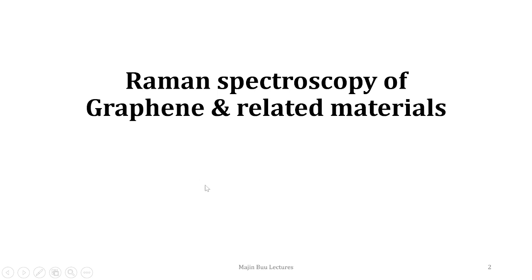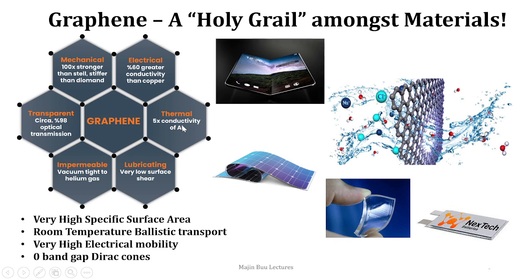In this presentation, we will be discussing the concept of Raman spectroscopy of graphene and its related materials. Graphene, as we all may know, has become very pervasive in quite a lot of applications ranging from flexible electronics to water purification, deionization, batteries, and many other applications, especially owing to its excellent mechanical, electrical, thermal, and other properties. Furthermore, this material is being widely used for engineering applications as mentioned, thus making it an engineer's material also.